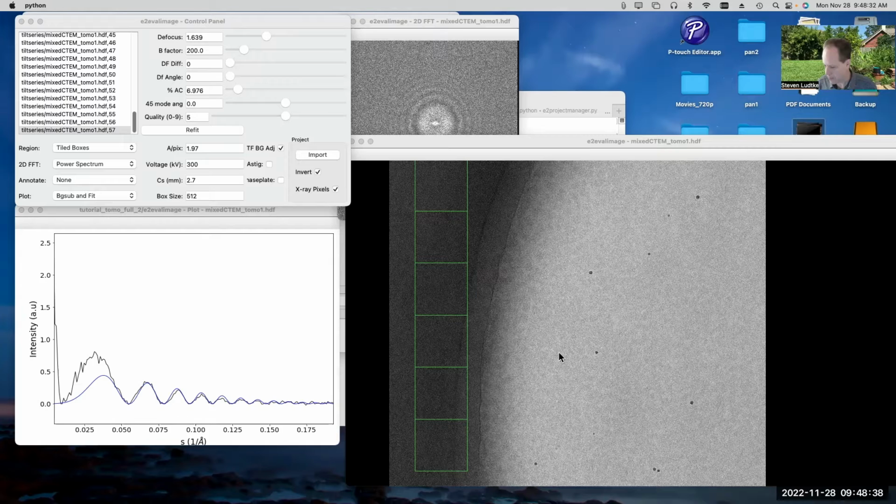So what does that mean? Since I know that this image is tilted in a particular way on a particular axis, I will assume that, say, this is 2 microns, and then this is 2.6 microns, and then that must mean that this is 1.4 microns on the other side.